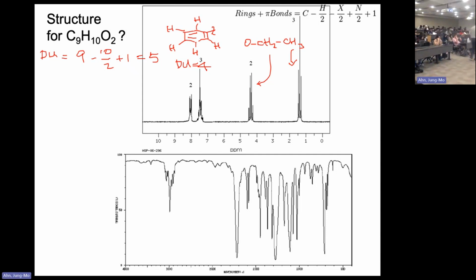So that clue can be found from here. So this is the IR spectrum. What information can you pull out from the IR spectrum? It depends on where you're looking at it. But I want you to look at this particular strong band coming down at 1710. If you have a deep signal down there, it could be anything. It could be aldehyde, ketone, or carboxylic acid. But if it's an aldehyde, you're supposed to have 2700, 2800 peaks, but we don't see that, so it cannot be the aldehyde.